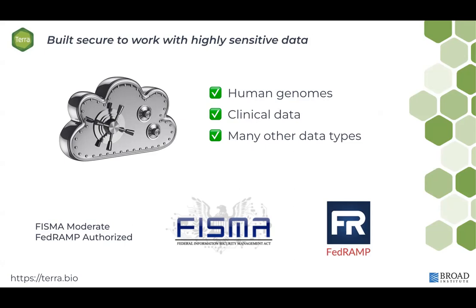I should mention here that whenever you log in to certain one of those data sets, there are 15-minute idle timeouts for clinical researchers if you step away from your machines. There are other types of timeouts, so there are a lot of security measures that make all of this possible. So sometimes you may have to re-log in or re-authenticate when you're using controlled access data sets. But all of this is done fairly seamlessly.